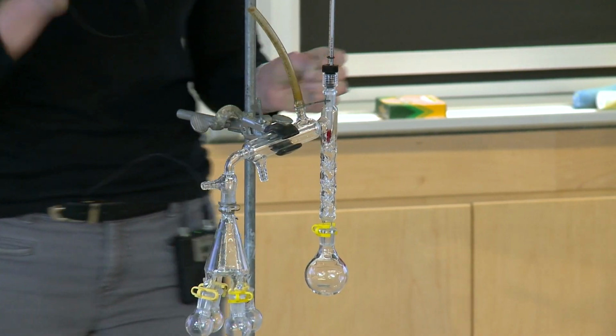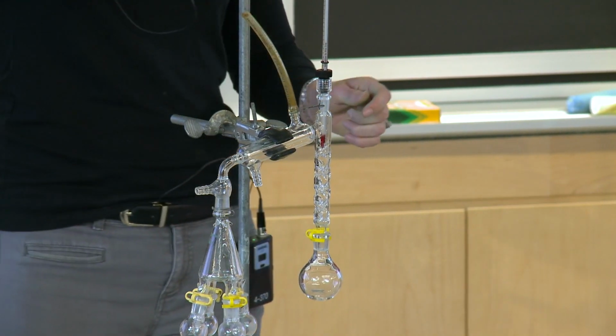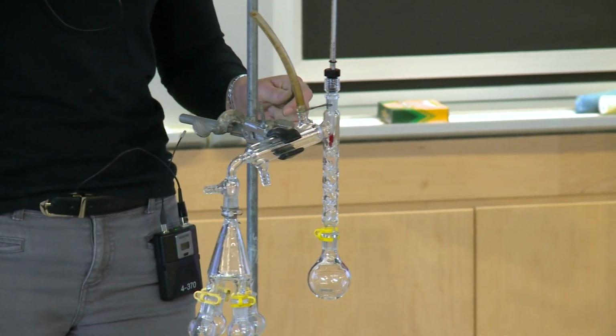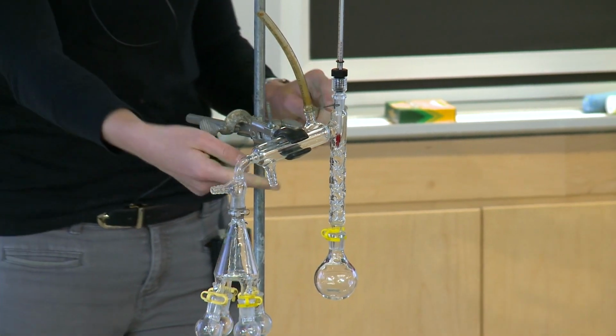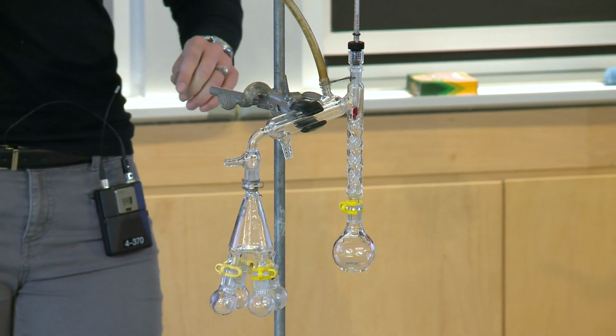And this is important because once you turn the water on, the water's at a pretty decently high pressure, and if you are not paying attention, the tubing does not stay on these little adapters very well. Your tubing will pop off, and then you have a faucet of water coming through a rubber hose.